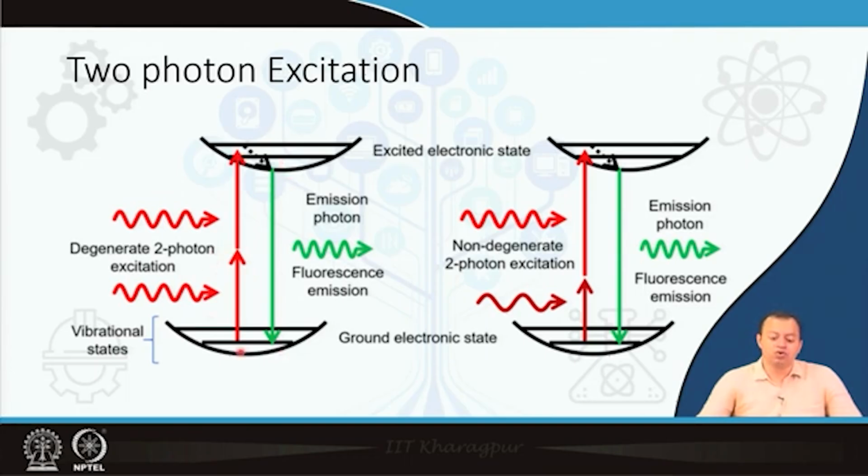Here remember you are doing non-linearity. Here the first photon is only raising the electron to the mid level, it is not going all the way up. So this photon is of this relatively low energy only, and then comes a similar photon, another one or a slightly dissimilar one, that takes it to the next level. So it is like this and this, a step in between. This step is half, this step is half. Usually it is discrete 1, 2, 3, 4, now it is 0.5, 0.5.